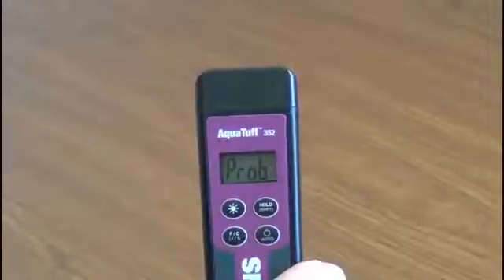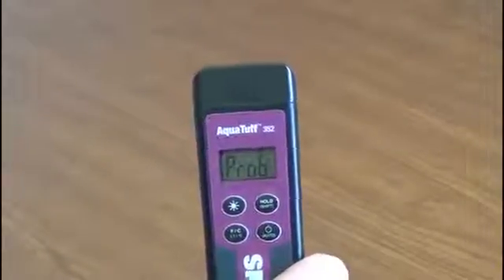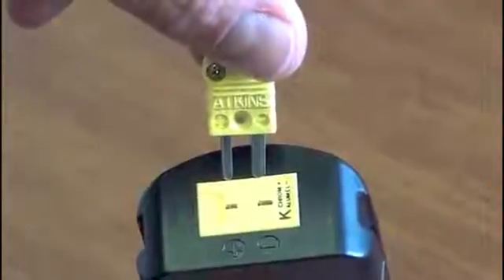PROB means there is no probe attached to the instrument. Next, insert your thermocouple type K probe. Make sure the plus and minus symbols on the plug line up with the plus and minus symbols on the connector. Insert the plug into the connector. Look at the screen.